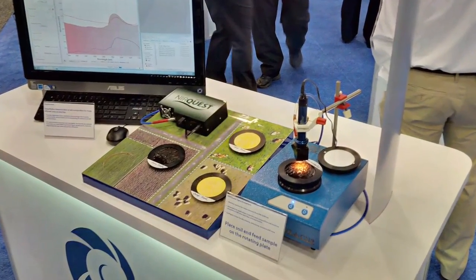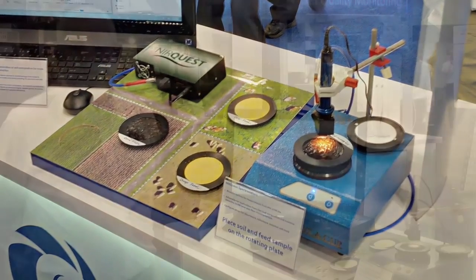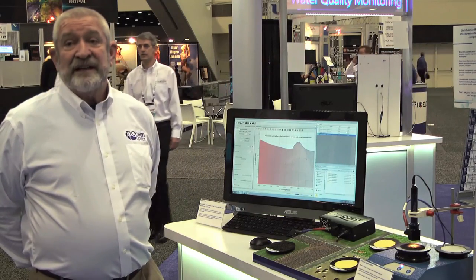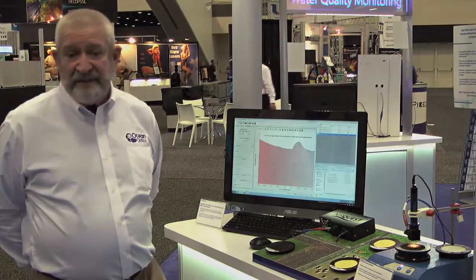So here we have it — a very small, compact spectrometer, easily portable, can be put on a tractor, we can put fiber optics wherever you want them, pointing at whatever you want to see, and now we have the perfect solution for analyzing dirt on a very big scale.